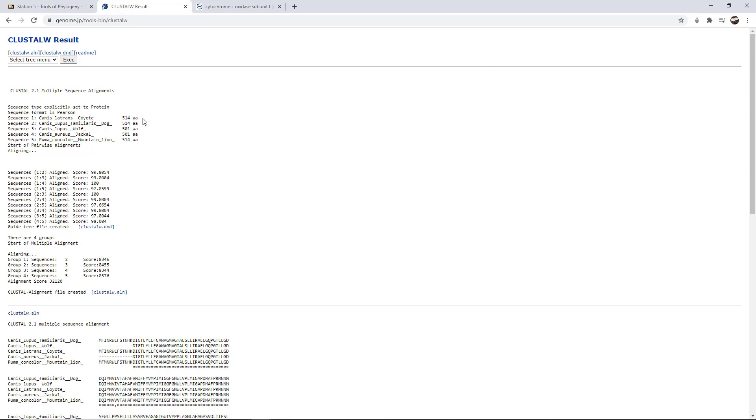A couple of things to point out. First of all, it tells us at the very top how many amino acids were counted in each one of the sequences. You'll notice that there's differences. Three of them have 514 amino acids. Two of them have 501.